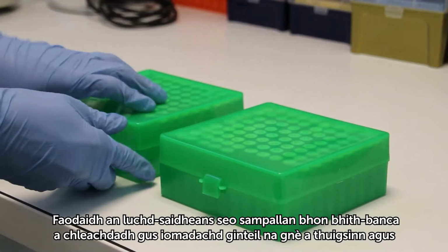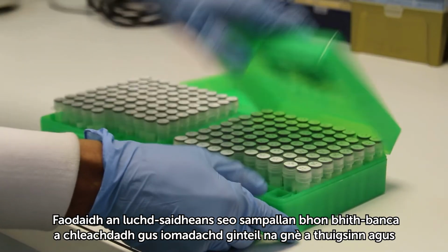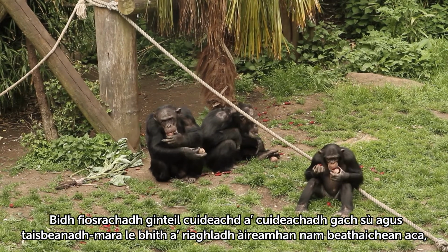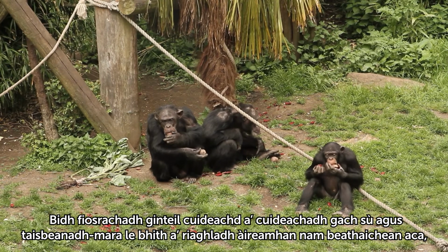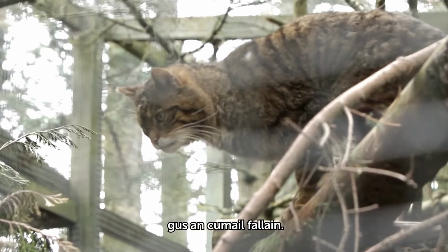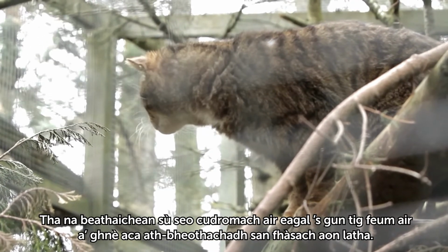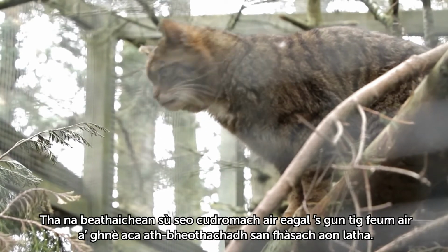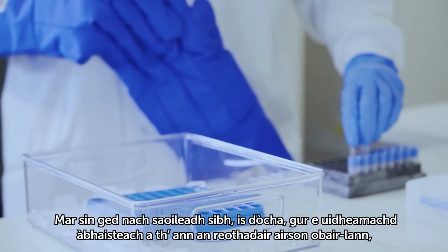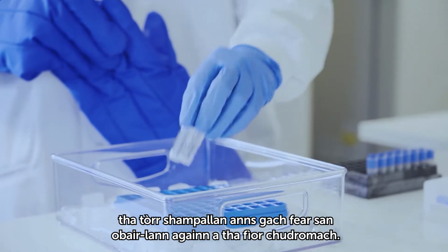These scientists can use samples from the biobank to understand the species' genetic diversity, and this helps them to protect them in the wild. Genetic information also helps zoos and aquaria manage captive populations to keep them healthy. These zoo animals are important, just in case the species needs to be reintroduced to the wild one day. So, while a freezer might not look like the obvious piece of lab equipment, each one in our lab contains a lot of very important samples.